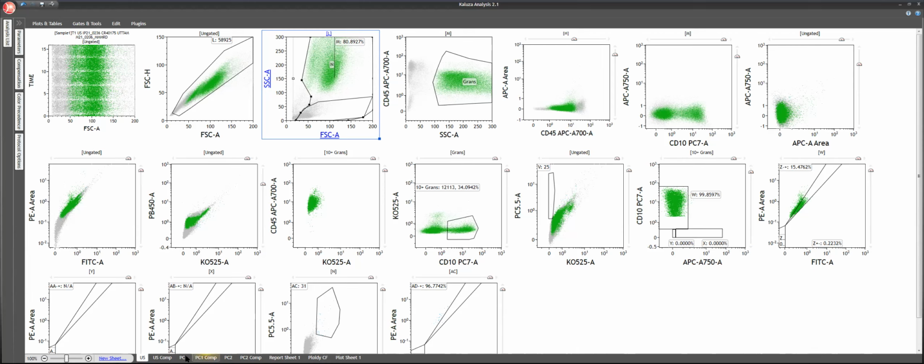So this was about the MRD analysis and other quality checks. So we use both the tubes. You see the kappa and lambda light chain restriction is very important to identify cells. And in its absence, unless you have very good experience and your whole setup is very well standardized, it can give you trouble to confirm the diagnosis. So personally, we believe that kappa lambda is very important for the MRD analysis.